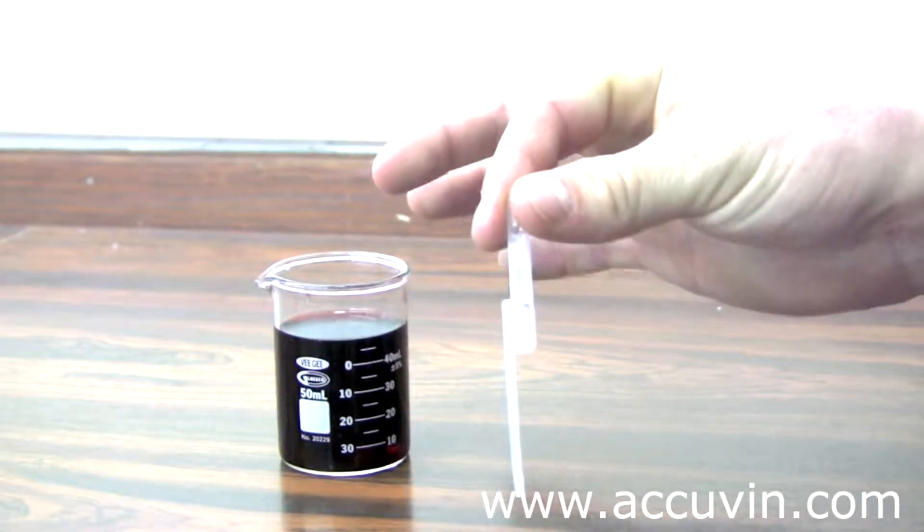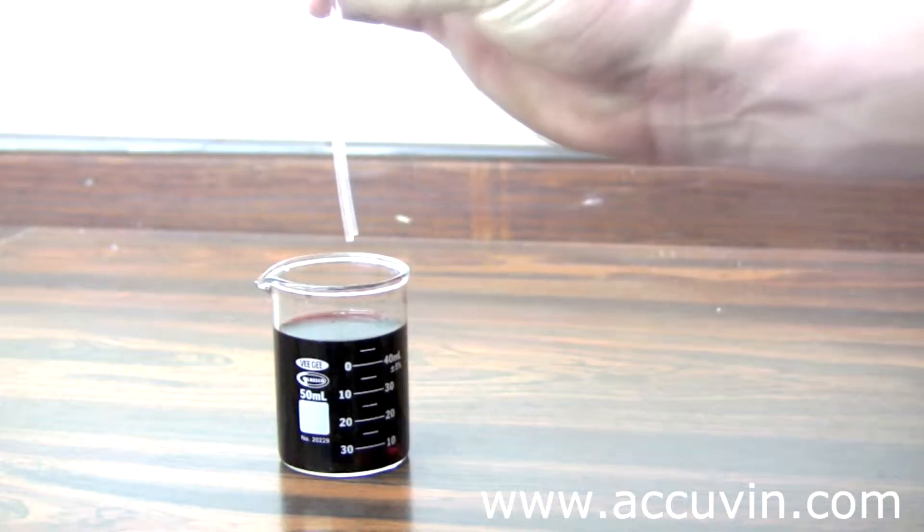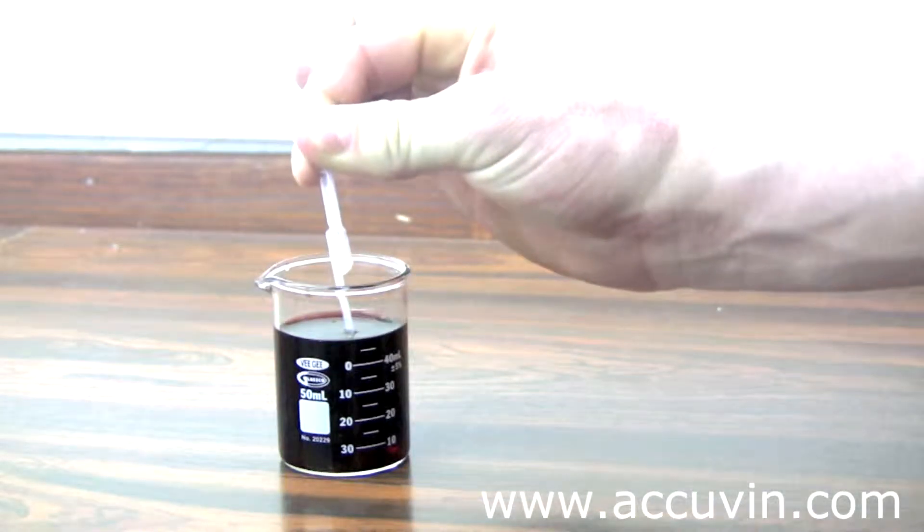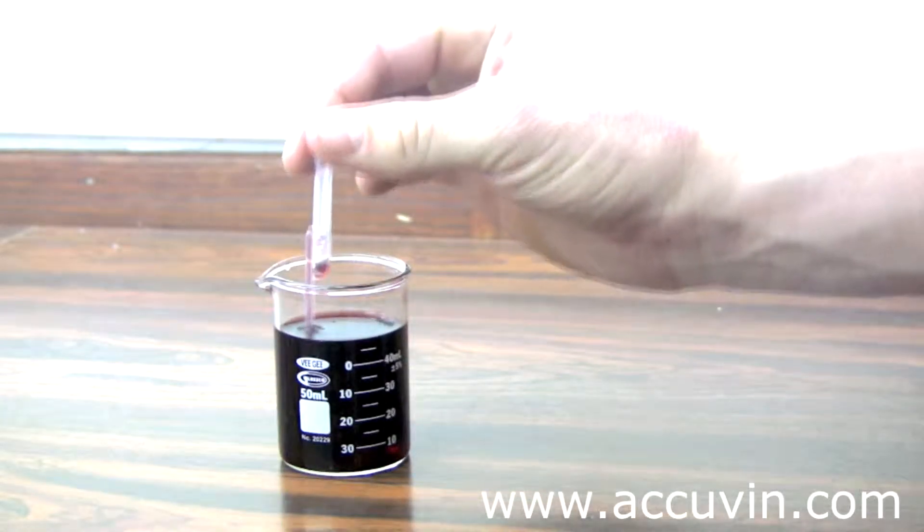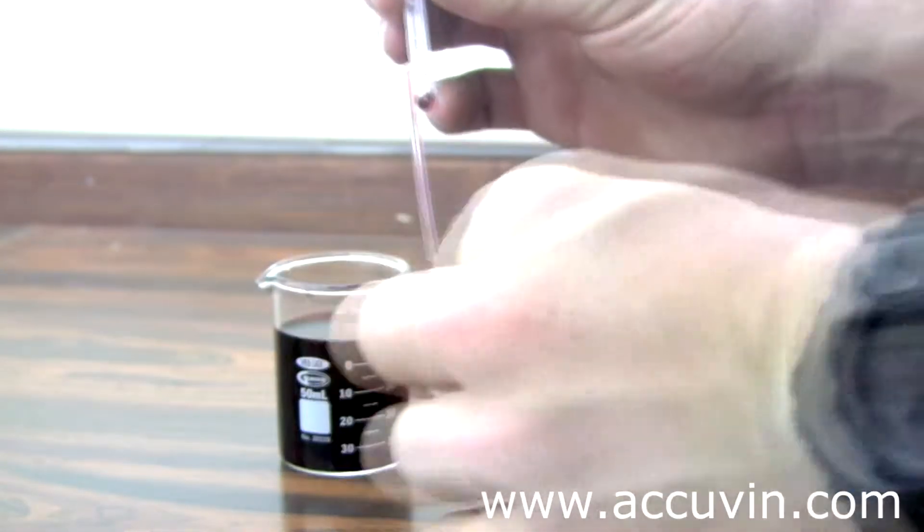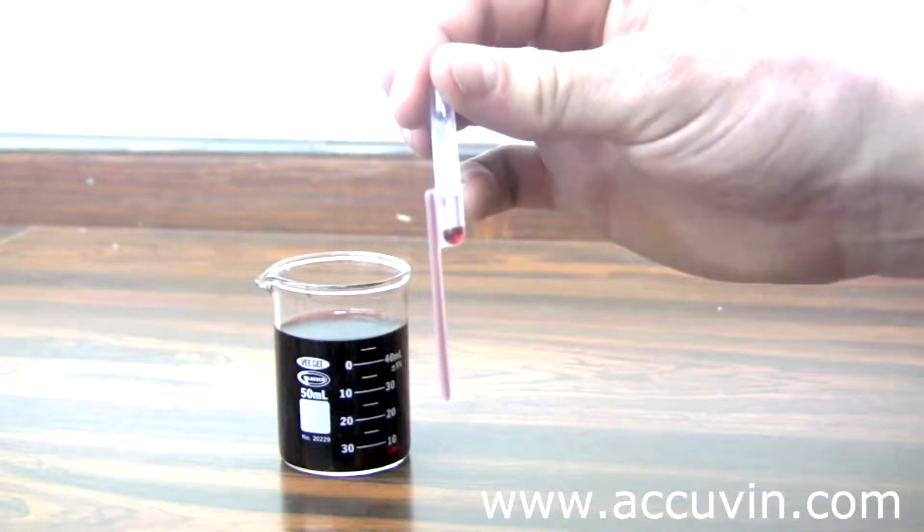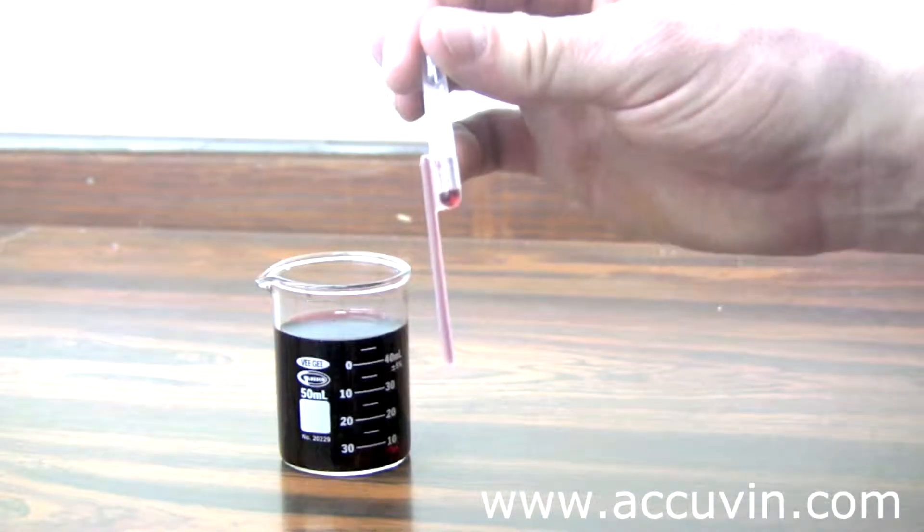Take the sampler and squeeze at the top, then put the tip of the sampler into the sample and release. Be sure to wipe off all excess liquid on the outside of the sampler, as any extra liquid will cause incorrect results.